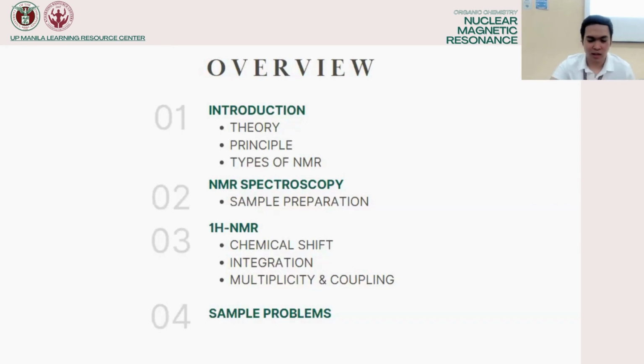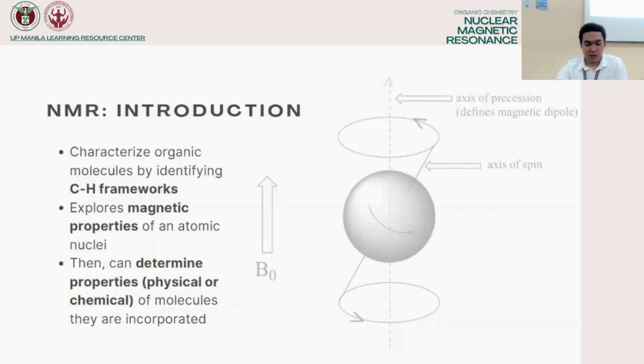And it has three components: chemical shift, integration, and coupling. And of course, sample problems. How do we attack them in the exam? Okay, so let's now go to the intro. So what's NMR?